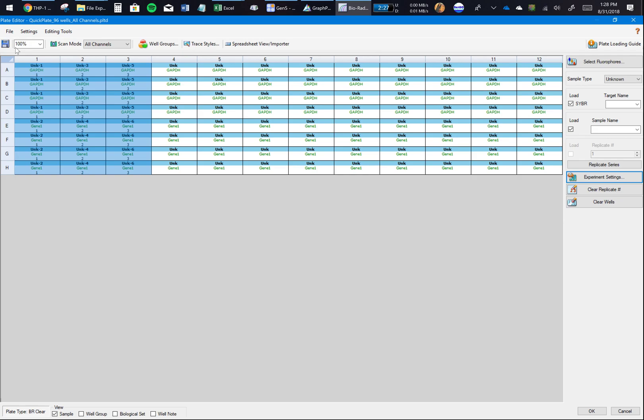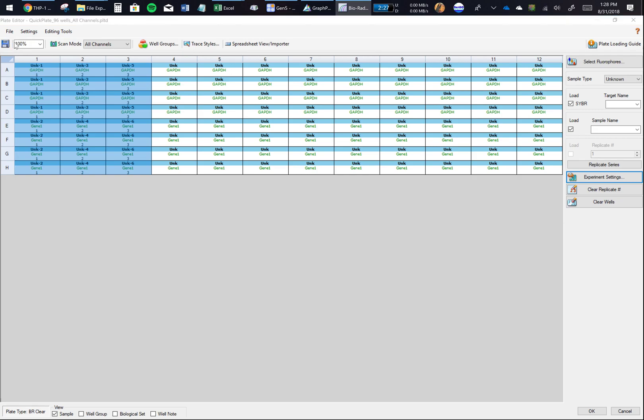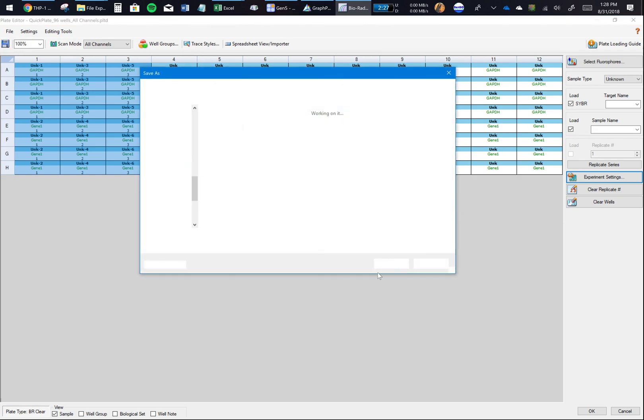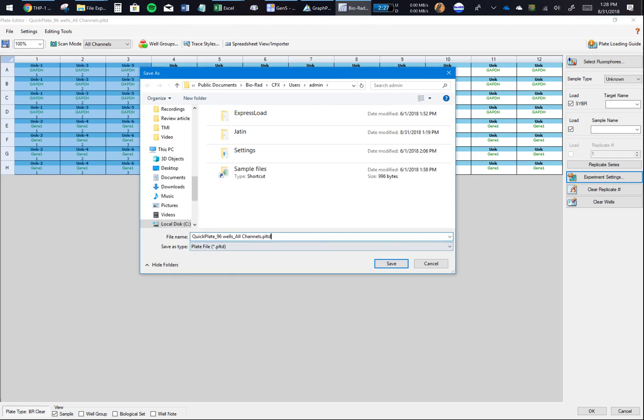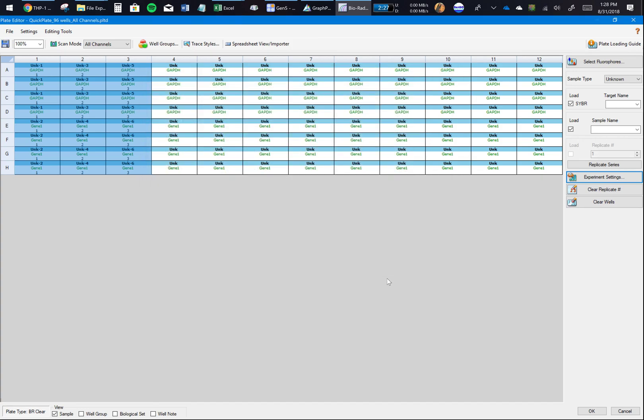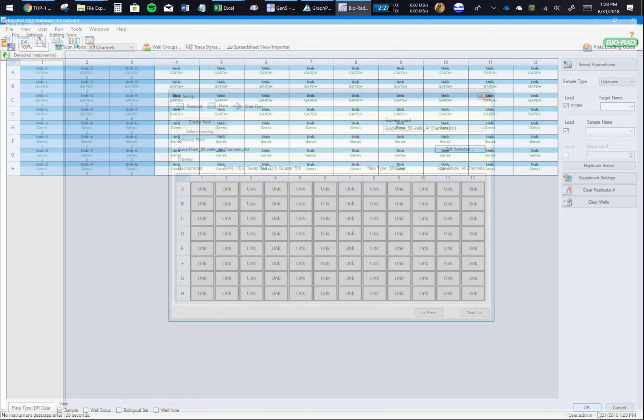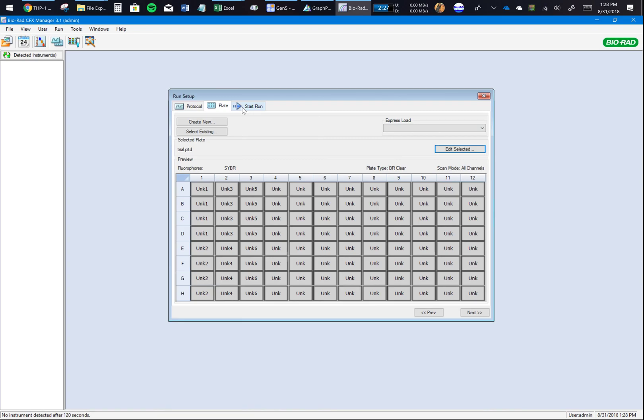My replicate size is 4 and I want to start my replicate number from number 1. Click Apply. You can also include which gene out of all the genes you've selected is your reference gene or your housekeeping gene, whichever you're using as a reference, but it can also be done after the assay's run, so it's not required at this point.